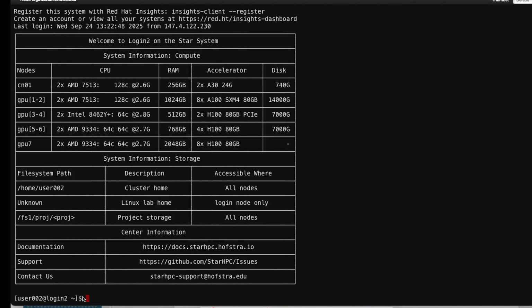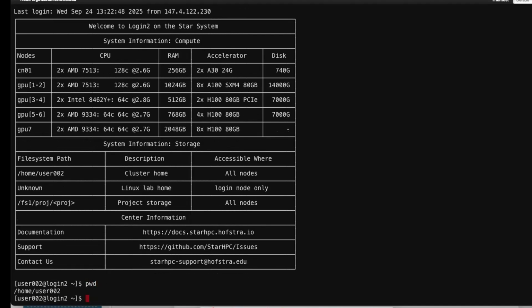So we can try typing lots of different commands here. The first one that I want to use is called pwd. And so this is going to print our working directory. So pwd stands for print working directory. And for all of you, you should see that you're now in a folder within another folder. So there you can see it prints out a directory structure.